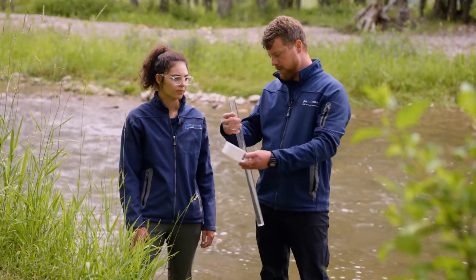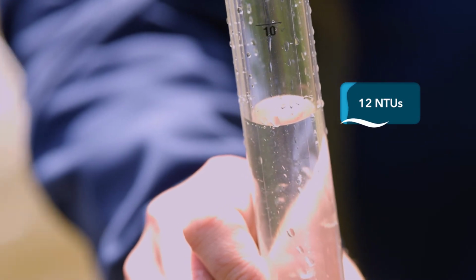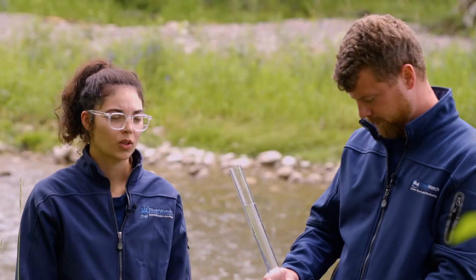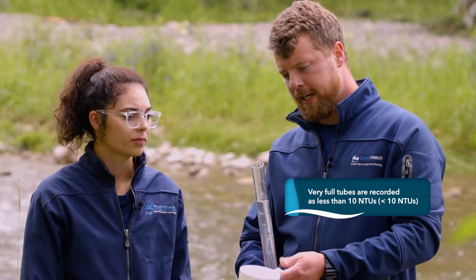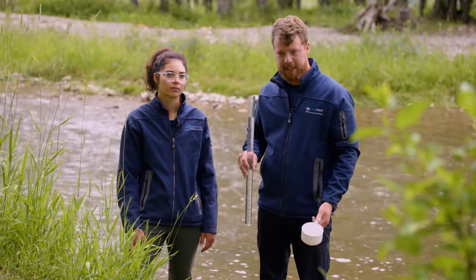Okay. So what's our reading on the side here? That is a reading of 12 NTUs. 12 Nephelometric Turbidity units. Okay. So what does 12 NTUs mean in terms of our turbidity? Yeah, in terms of our creeks, that's a very low reading, actually, for turbidity. It generally means our creek is relatively clear.